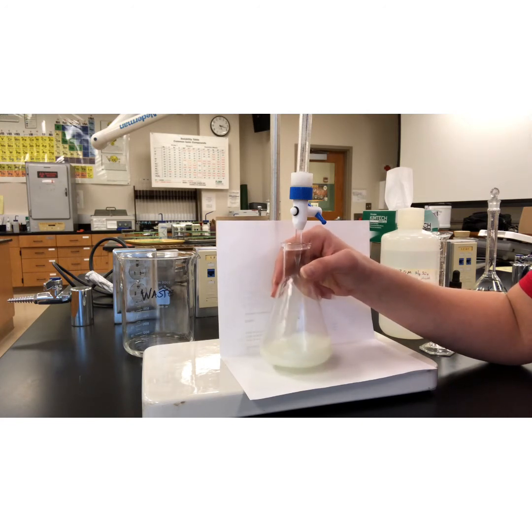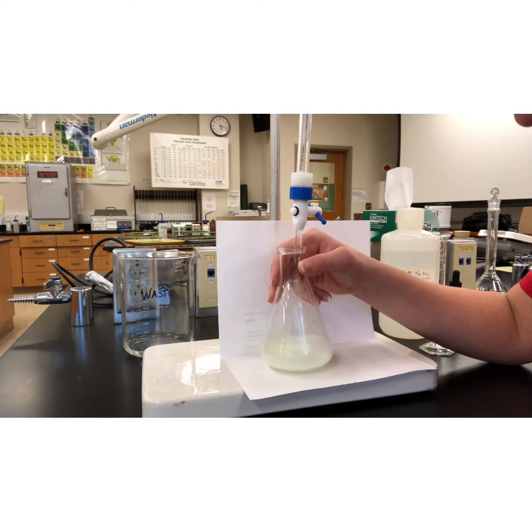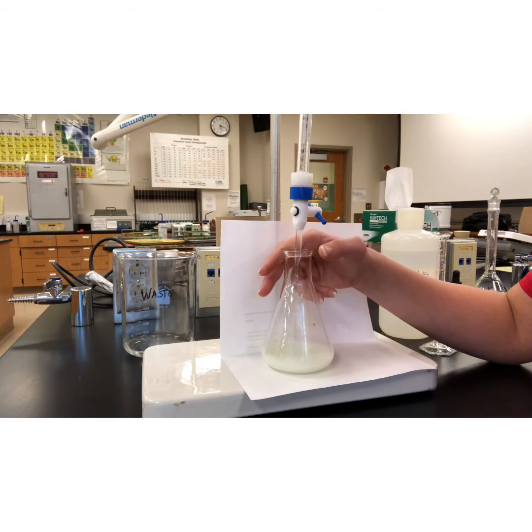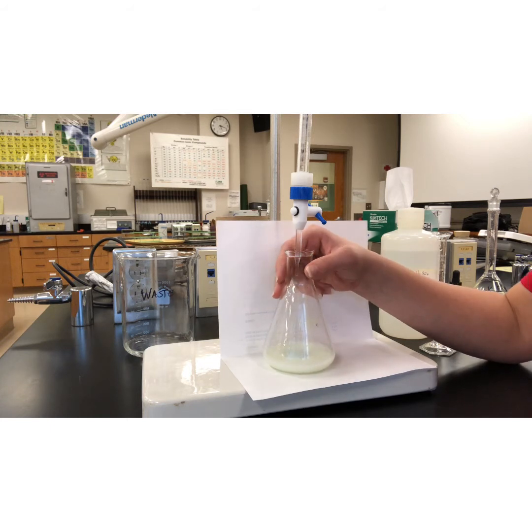So you can see the color of my solution changing. It was clear and yellow. It's definitely got a milky yellow tinge. Every drop of the zinc sulfate that hits, there's a blue tone that lingers longer and longer. See, can you see them in there? They still go away when I swirl.